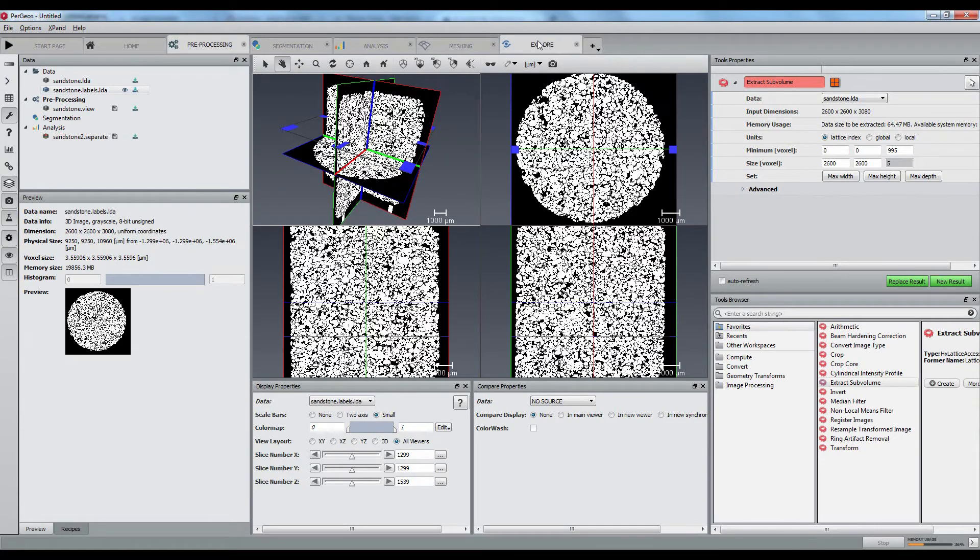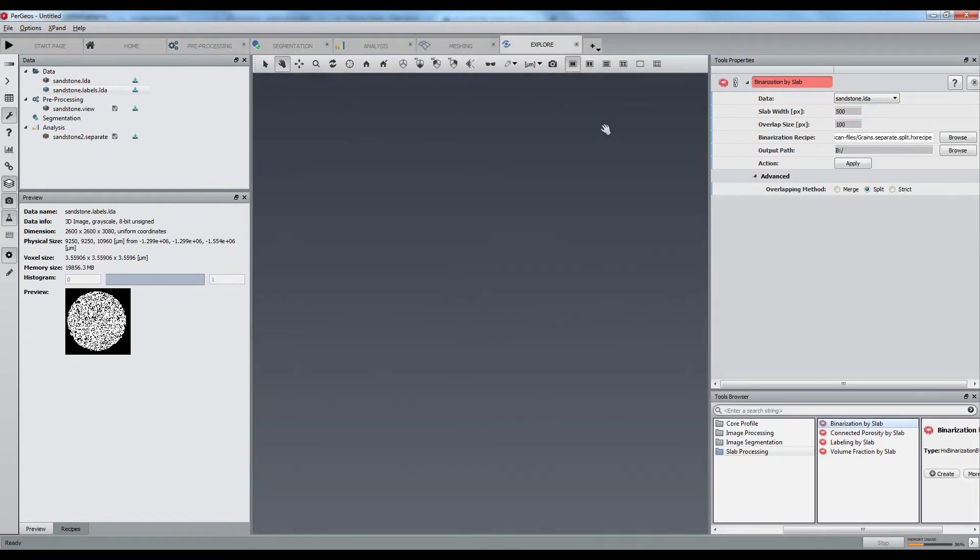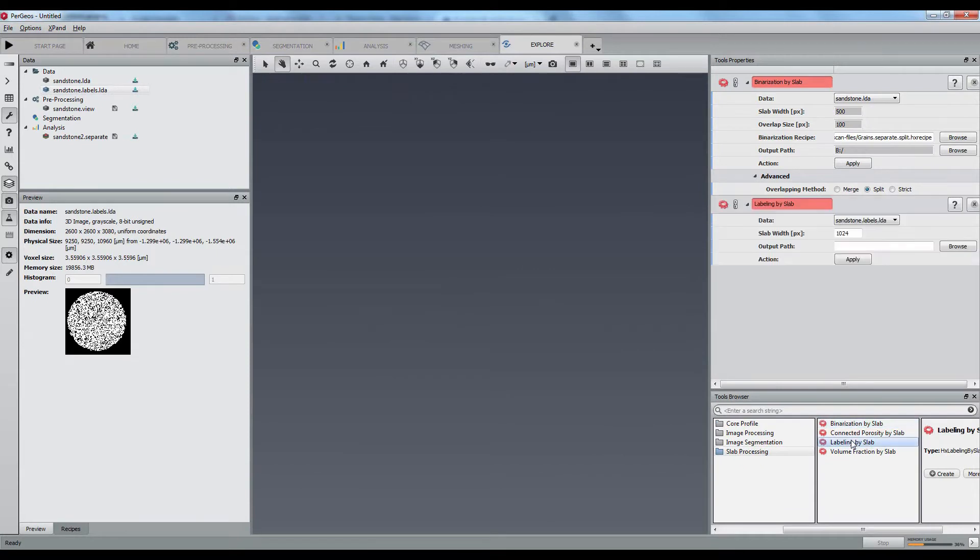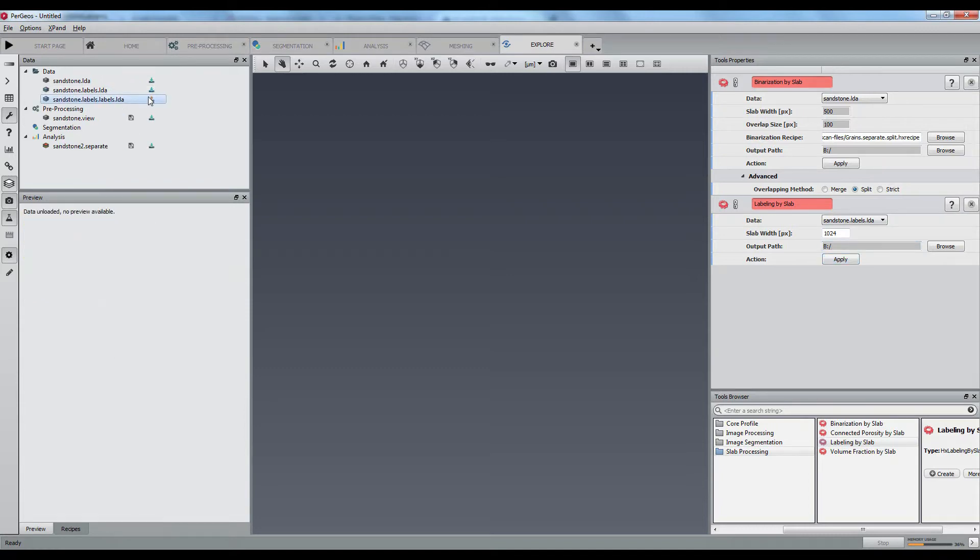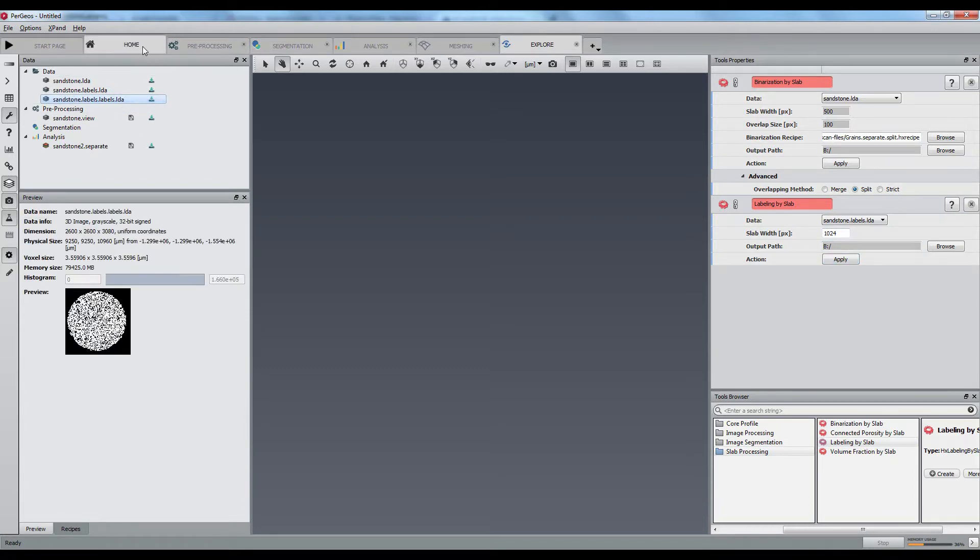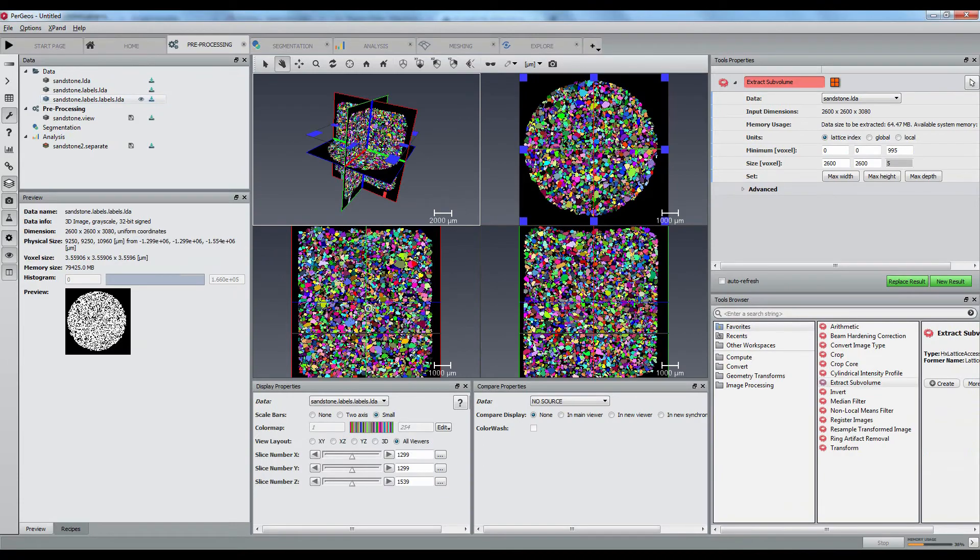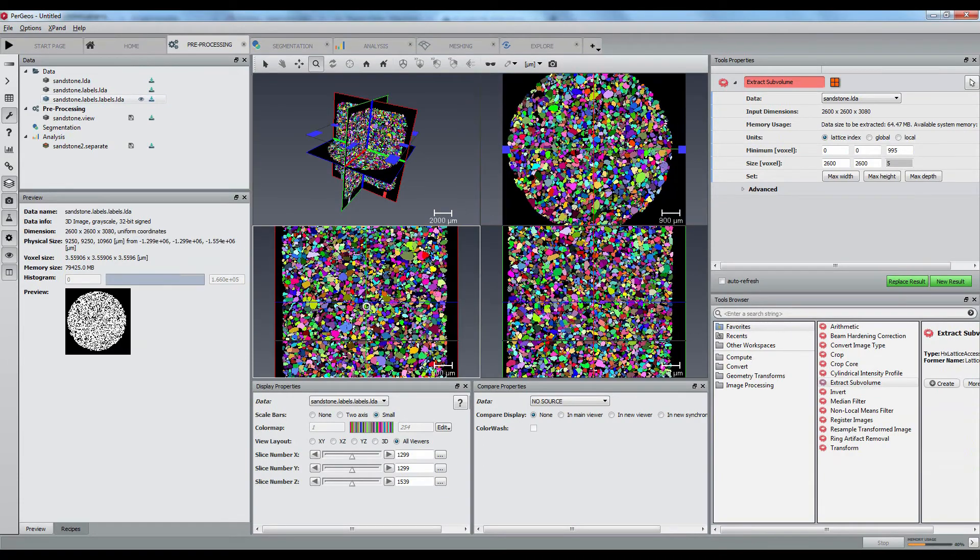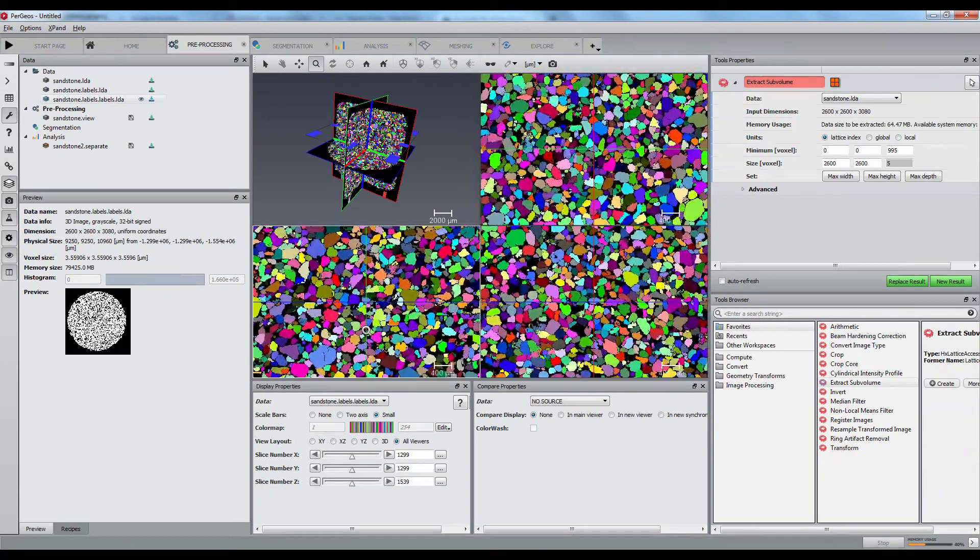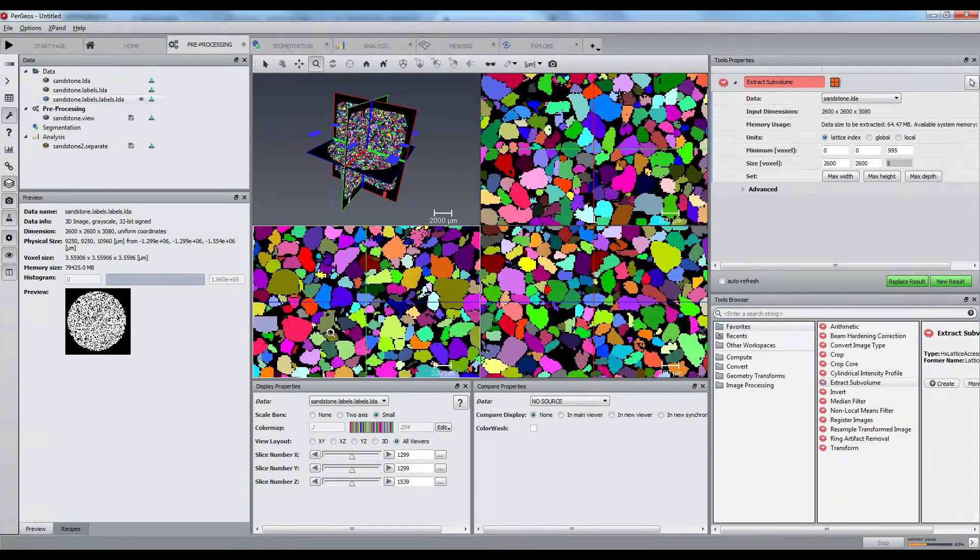We have here binary data that still needs to be labelized by labeling by slab. Now, all grains have a unique ID, and we could proceed with the analysis of their size, sphericity, or orientation.